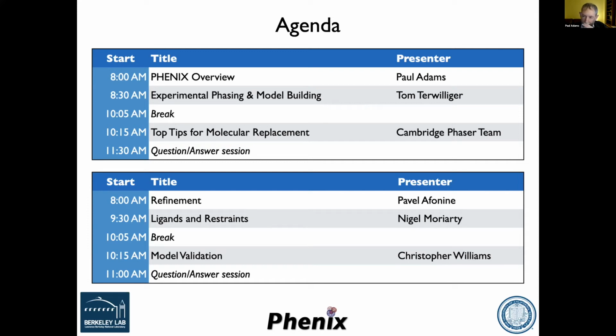Okay, so I think I'm going to get going with just a quick introduction to Phenix. I'm going to guess that a lot of you have used Phenix before, which is great. But for those of you that haven't, or haven't for a while, I thought it'd be good to do a quick introduction and then a very quick tour of the graphical interface.